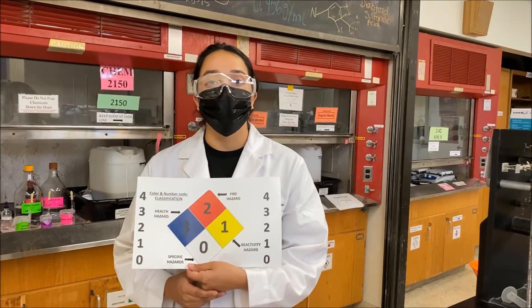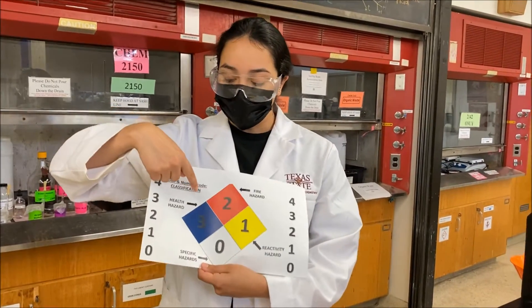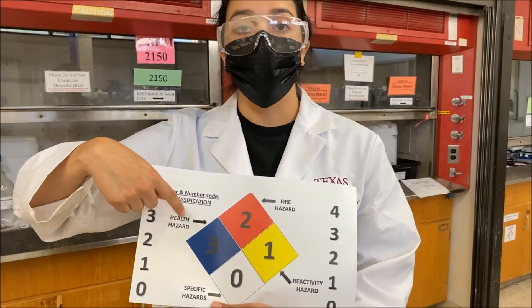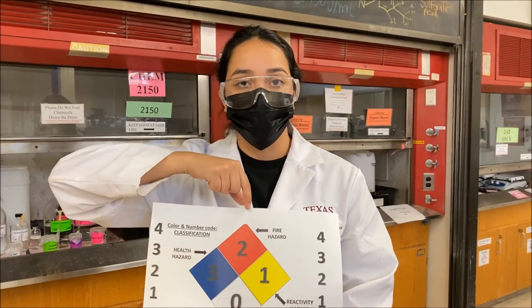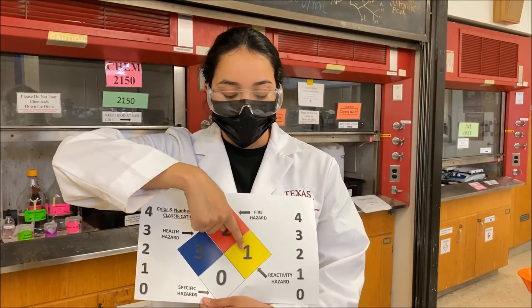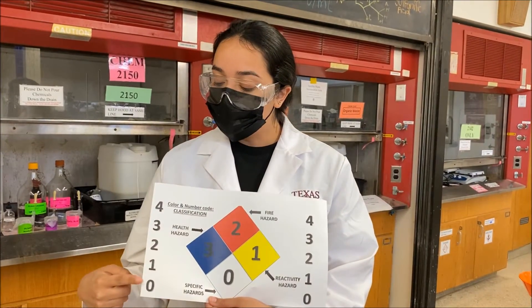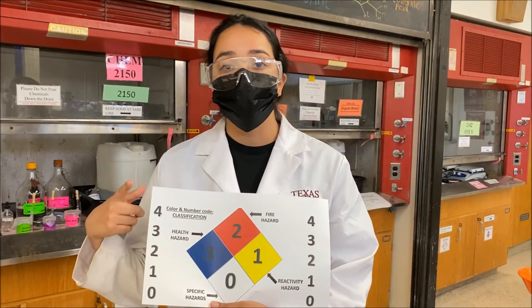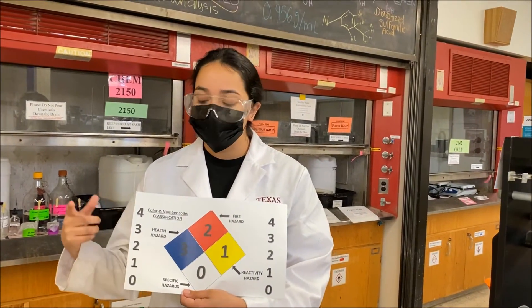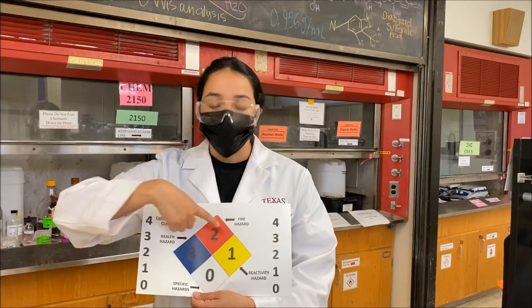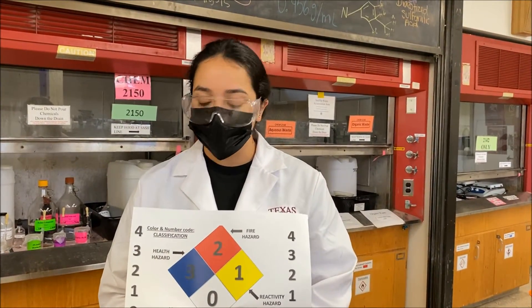In addition to the color signs, there is also a number system. The color signs show: blue for health hazard, red for flammable hazard, yellow for reactivity, and white for specific hazards. The numbers range from 0 to 4, with 0 being the least hazardous and 4 being the most. These numbers can correspond with any of the colored boxes on the hazard sign.